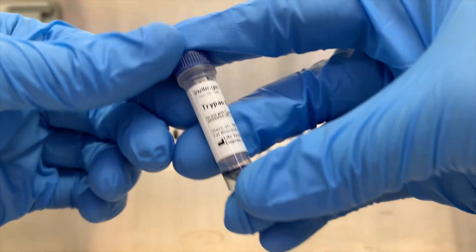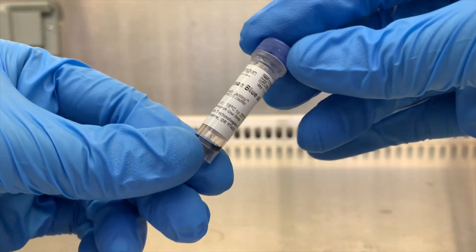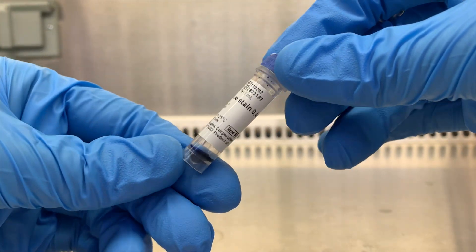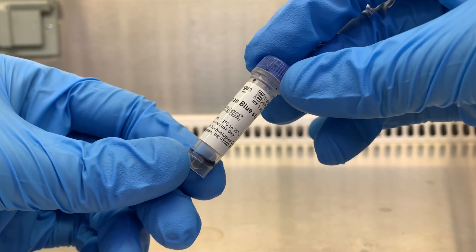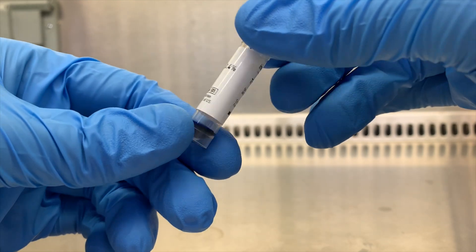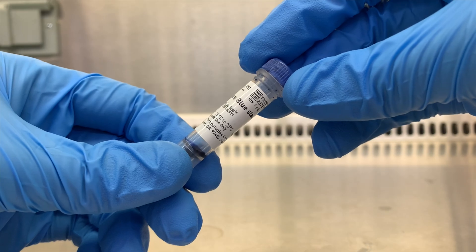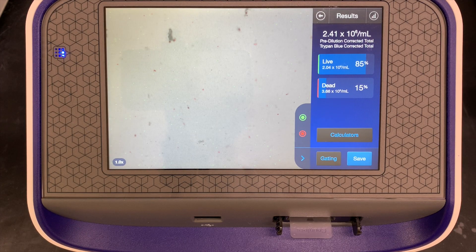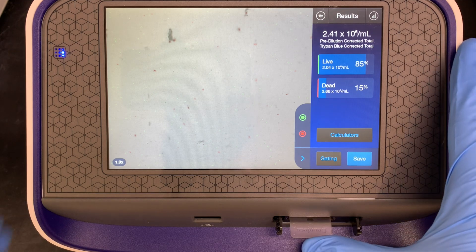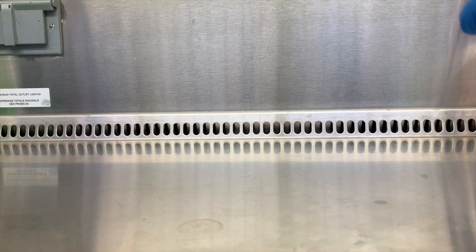And for the last issue I'll cover — this only really matters if you're using a similar cell counting method as me — let's quickly look at trypan blue. So this dye can be dirty, meaning there can be a lot of debris that settles at the bottom, which can make cell counting tough or less accurate. For that reason I try not to mix this dye before using it, and I pull from the top of it. Here's a comparison of cells stained with the cleaner dye near the top, and then the dirtier dye near the bottom — whole lot of gunk. Once I use enough stain that's mostly dirty like this, I just start a new one. The big bottles make it easier to just pull from the top when there isn't any sediment.